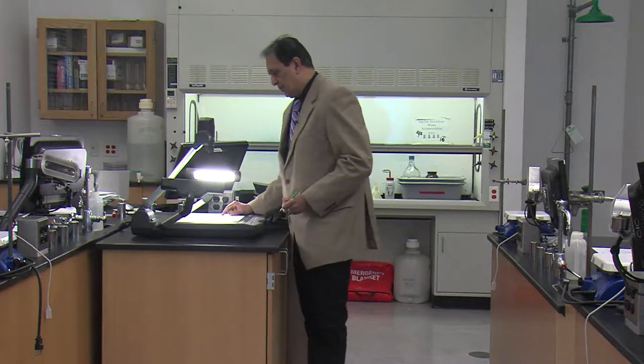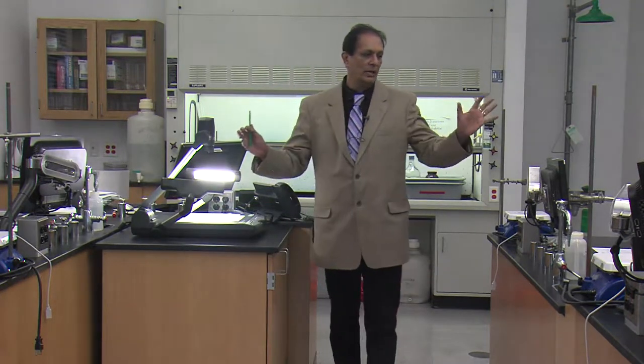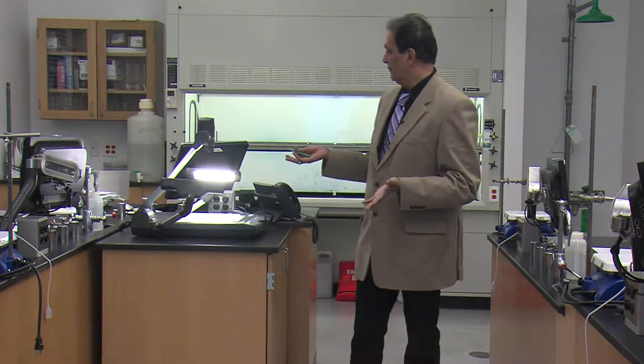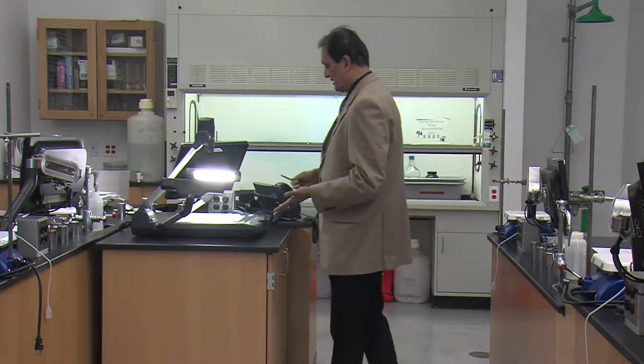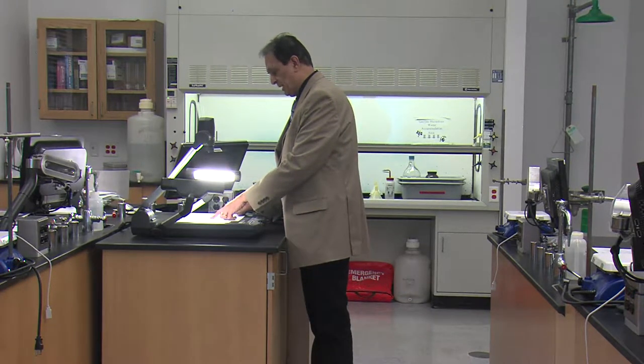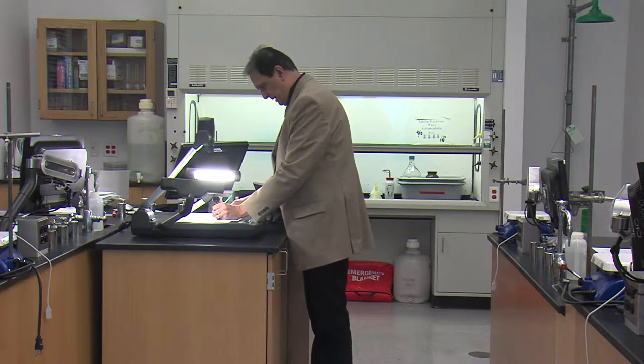You are expected to attend only the assigned lab section. We have only 20 spaces here, okay? We cannot have a 21st student or 22nd student coming in, all right? So attend only the lab sections that you are assigned. That is number 9. Number 10, know all your exits.